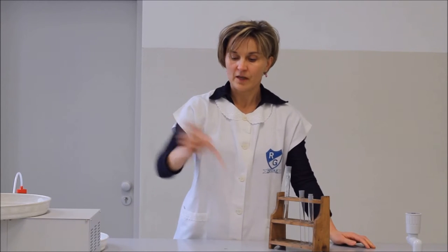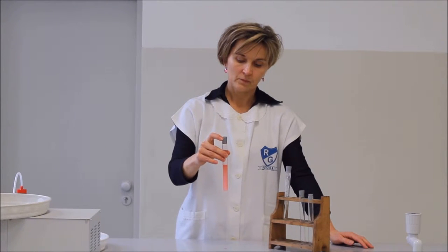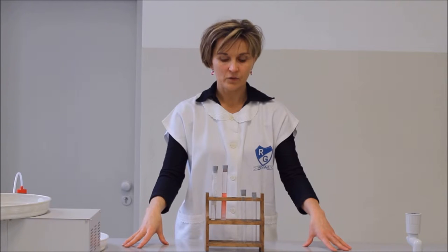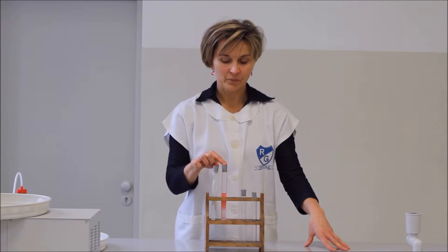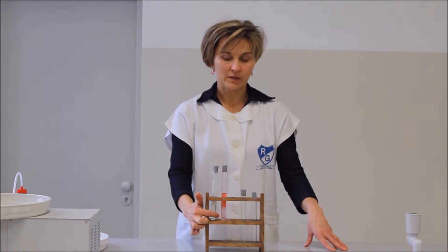Ezután erőteljesen összerázzuk a kémcső tartalmát. Kis idő elteltével megfigyelhető, hogy az olaj nem oldódik a desztillált vízben. Szétválik a két folyadék egymástól. Az alsó fázisban találjuk a vizet, a felső fázisban található az étolaj.